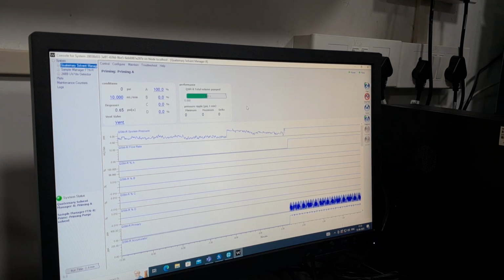You can use a lower volume sample, but other vials will be needed. Now we are using flat bottom vials. It does not take that. What kind of vials do they use? Now we have the flat bottom one. Yesterday Surajit got some of the vials, no? All the vials are kept here only.